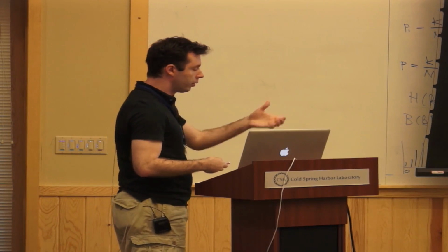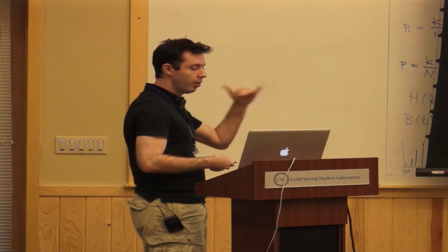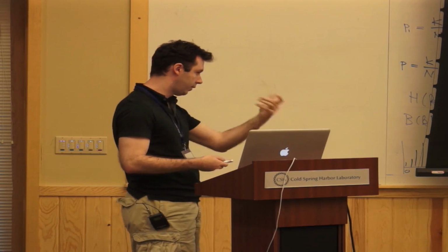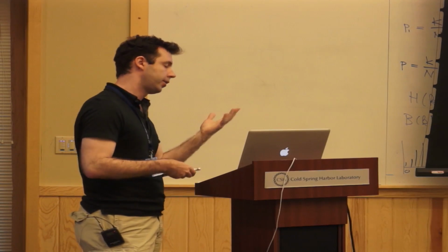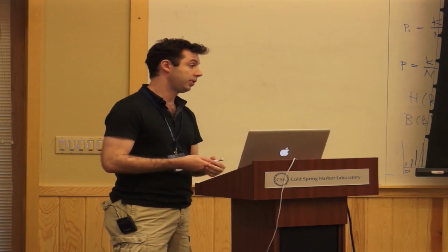When Bowtie wasn't doing that well, you would see that BWA would align somewhere between 2 and 5% more reads than Bowtie because of its ability to identify indels. That does not seem to be the case anymore. They are about equal now, and Bowtie is actually a bit faster. We've just been using BWA for a long time, which is why I have these slides. But Bowtie and BWA are equally good for ChIP-seq.